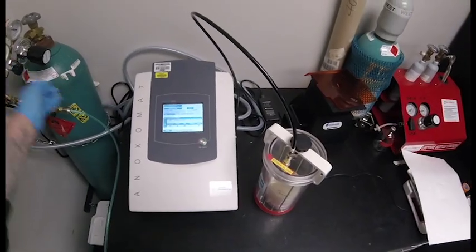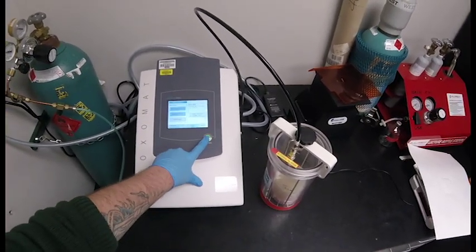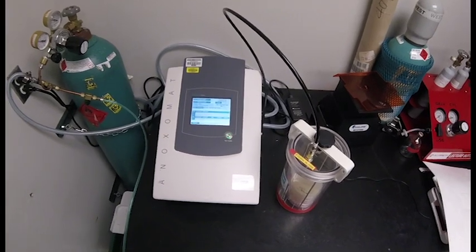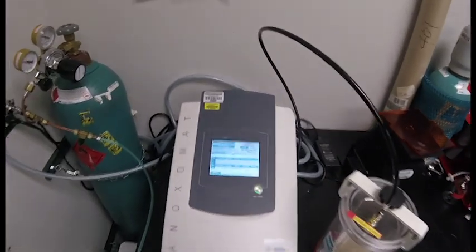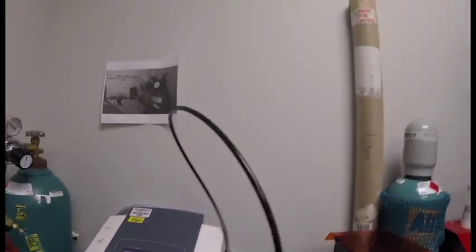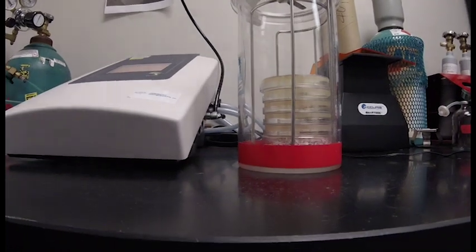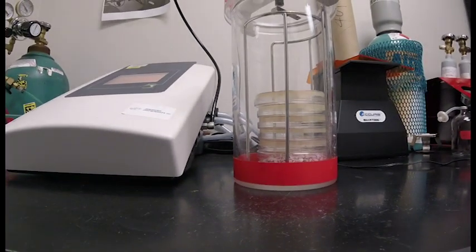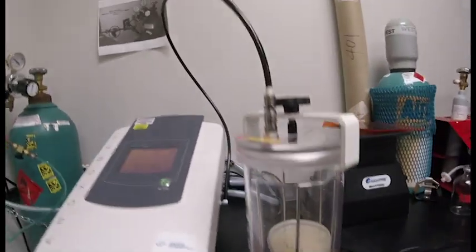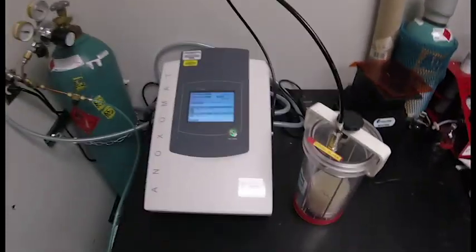Supplying gas to methanotrophs growing on agar plates requires hardware which will add gas into a sealed jar. Alternatively, the plates can contain methanol which will also support the growth of methanotrophs. Plates should be incubated upside down with the agar side up.